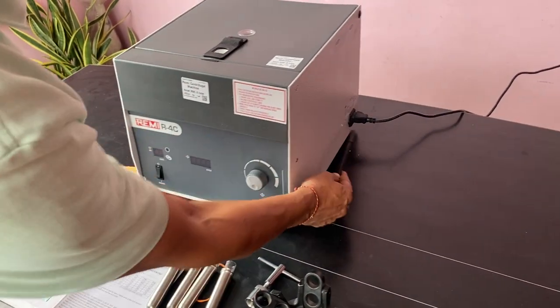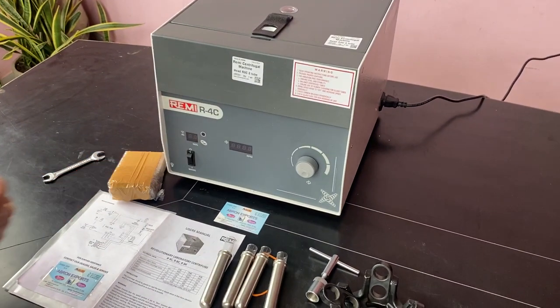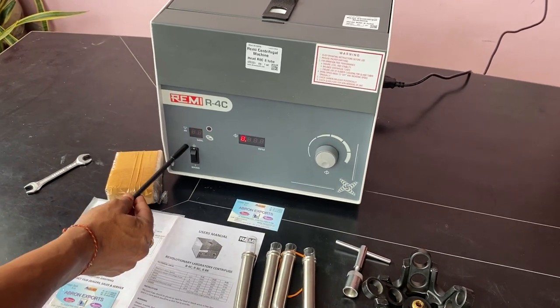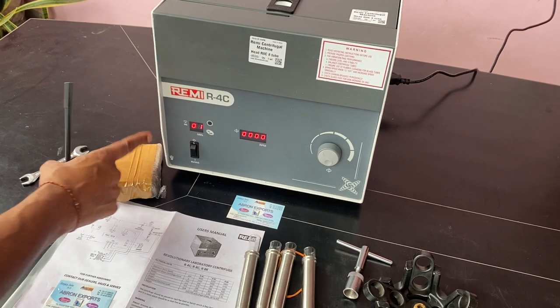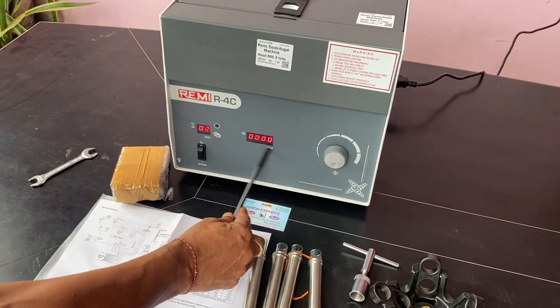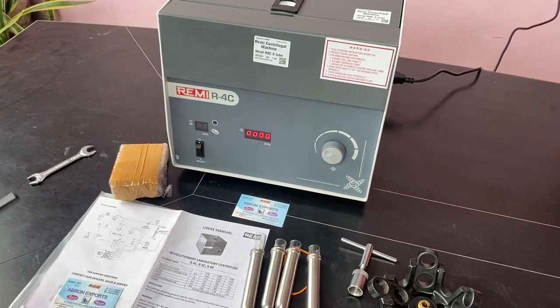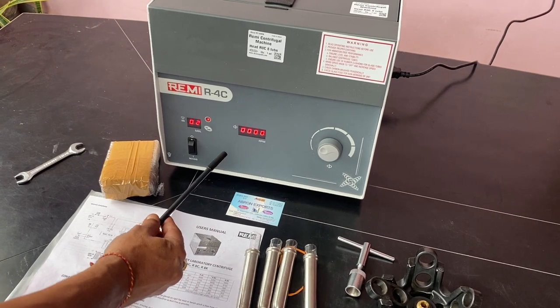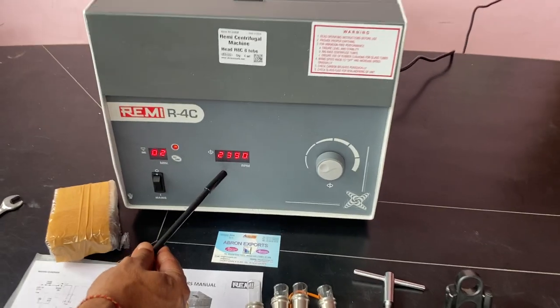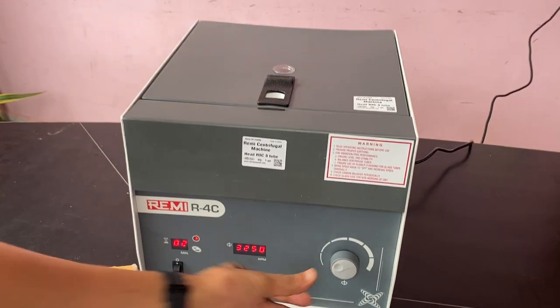First of all, you connect the wire here and when you connect it, switch on. This is a timer — you can set the minutes: one minute, two minutes. And this will show you the RPM; this is a knob for RPM. When the centrifuge is working, you can see the speed. Now it is about 2600 RPM, but the lid cannot open — it is automatically locked.